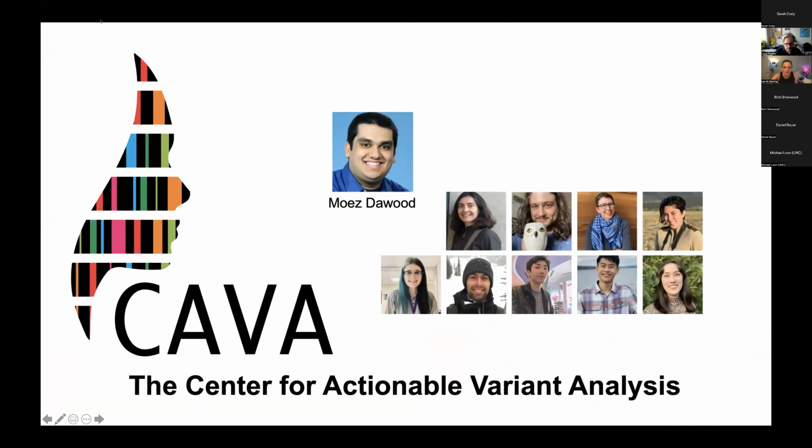Okay. As soon as Moez gets the slide up, we're joining the CRISPR workshop today to tell you about a core method from our center called saturation genome editing. The whole team is here on the slide, and Moez Dawood, who's a borrowed graduate student from Baylor College of Medicine, will tell you about the hundreds of parameters that he's optimized for this protocol.